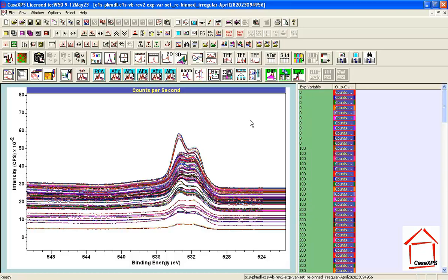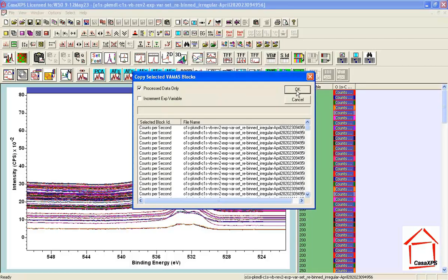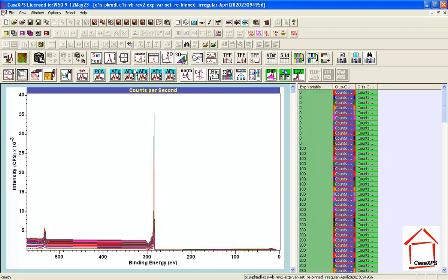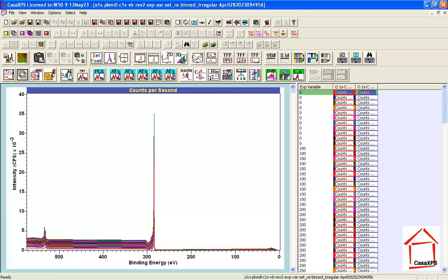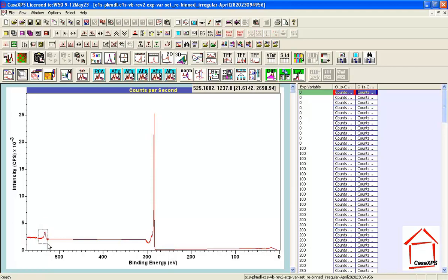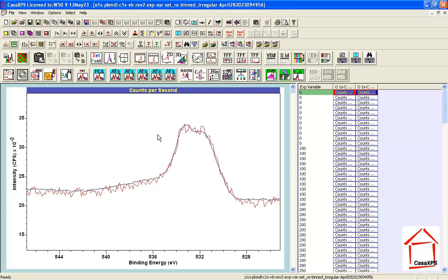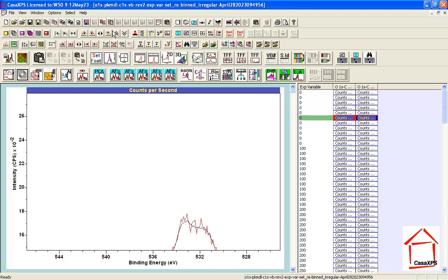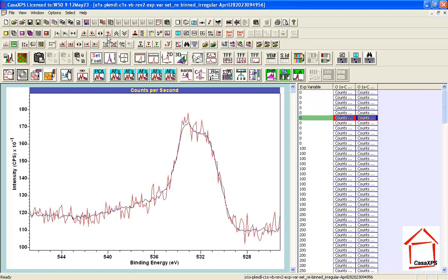I will now copy all the processed smooth data using this 'copy VB to new column' button. I end up with my smooth processed data, and I can do a comparison by overlaying the first abstract-factor-enhanced spectrum against the original data. Going down the list, the quality of the fit is reasonably good for all of these initial spectra.